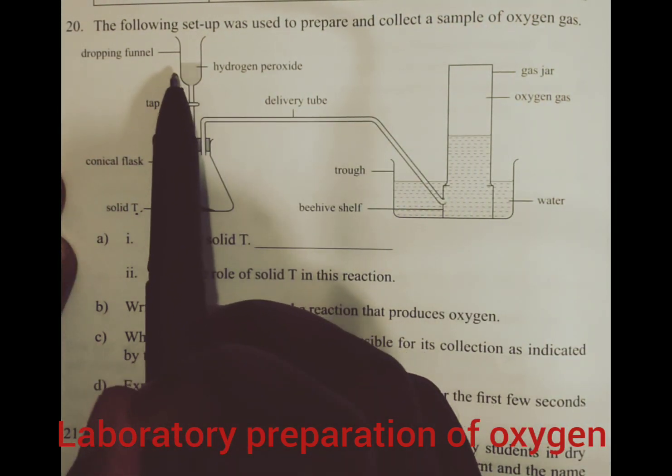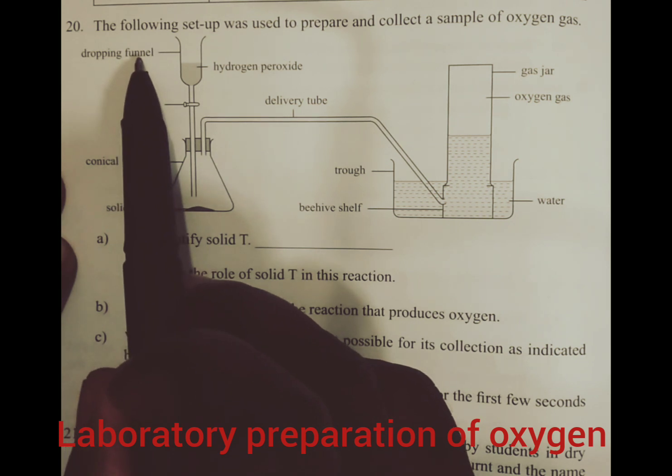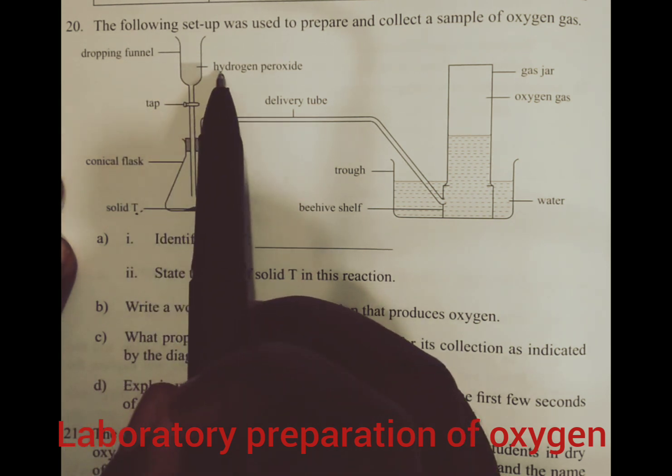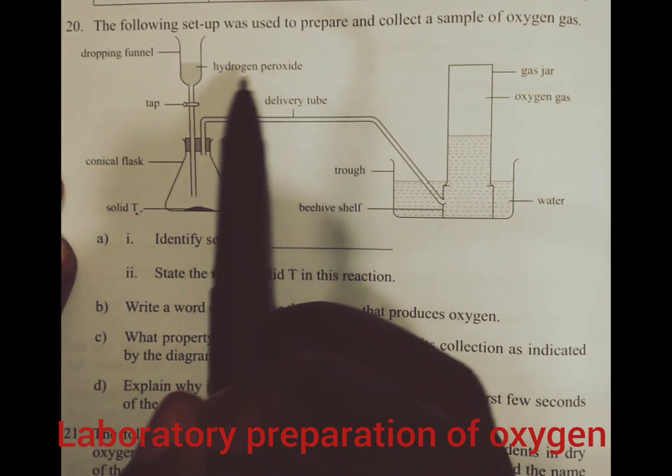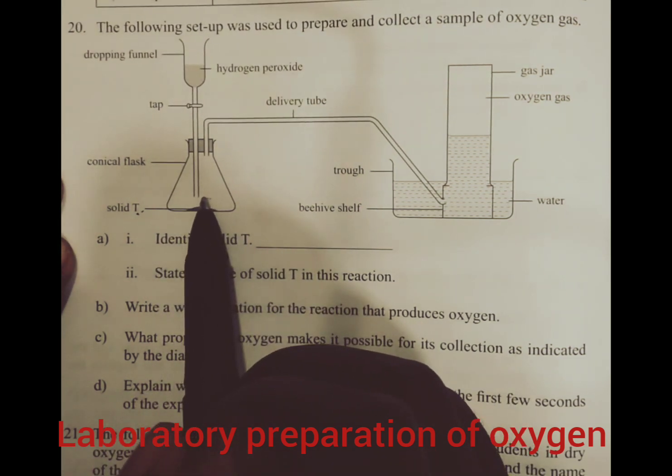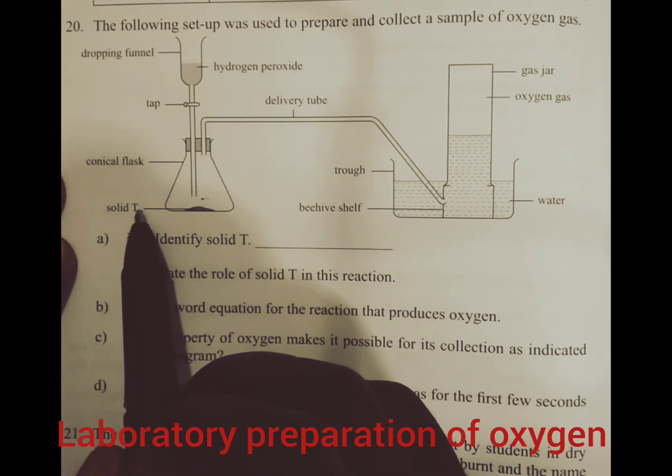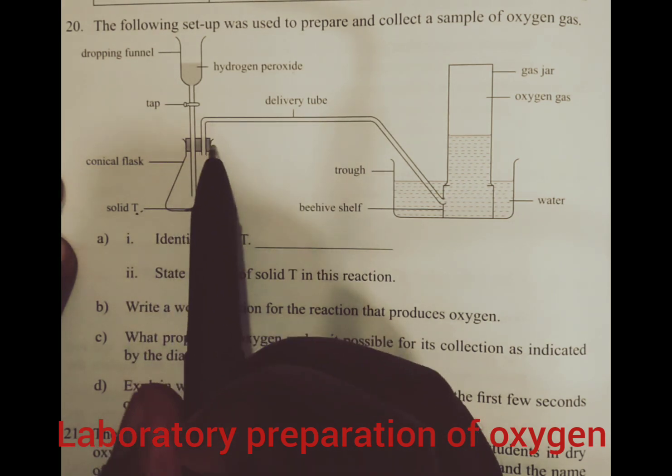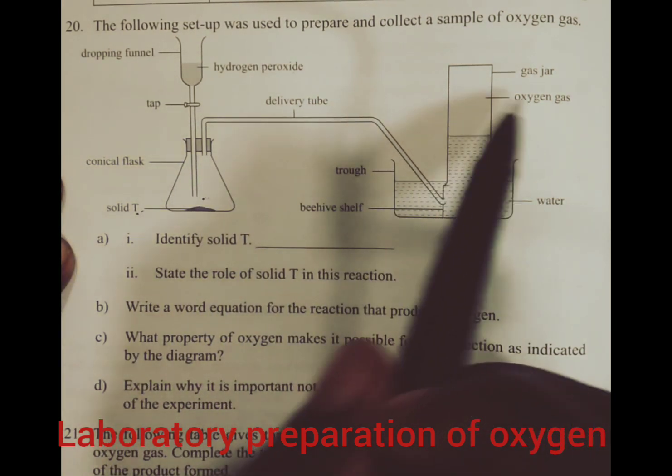We have the setup. We have the dropping funnel that contains hydrogen peroxide. Hydrogen peroxide will come into the conical flask, then decompose to liberate oxygen gas.